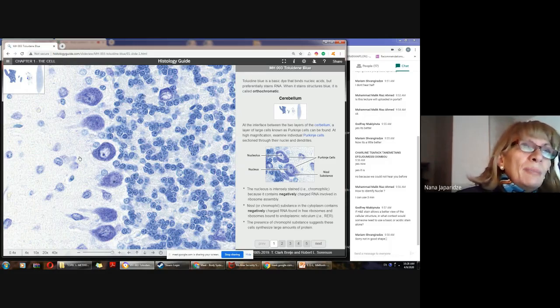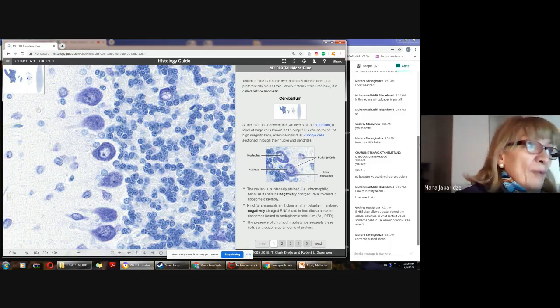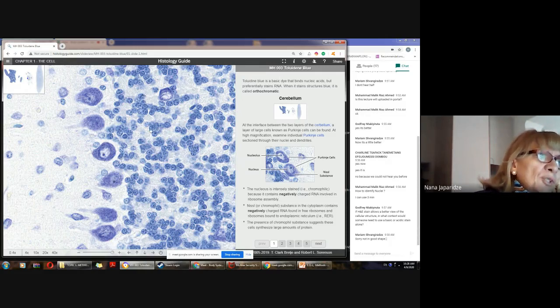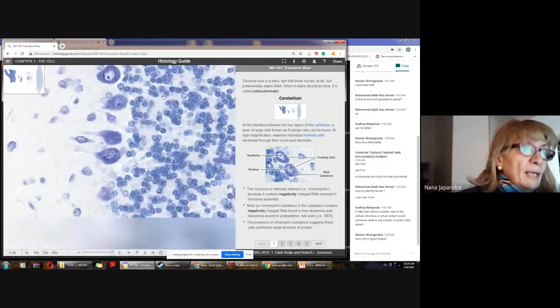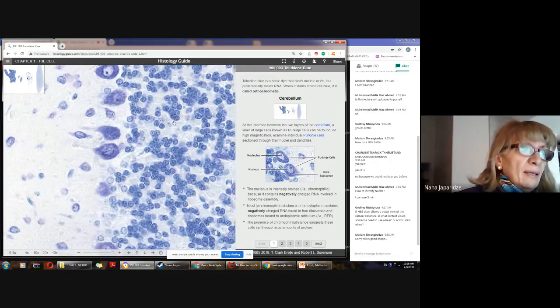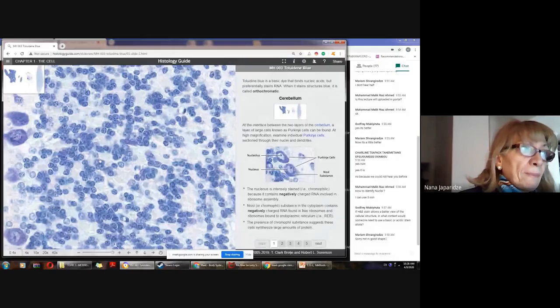That is why we became able to identify what type of cells, what type of neurons we are talking about, what shapes they have, what size they have. When we use, for example, tissue samples, and when we see cells here, we can even measure the cells, because the scale bar is always represented on the image.